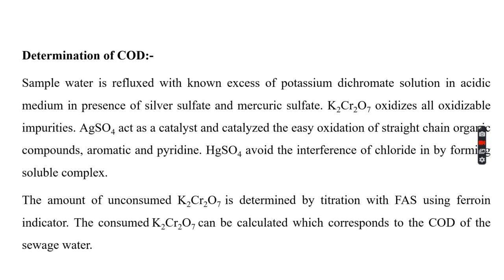It is preferable to BOD as the results are reliable, and it is a rapidly measurable parameter. Within 3 hours, we can predict the total organic load present in the water. COD is always greater than BOD because it tells the total organic load. And determination of COD is a very simple method.